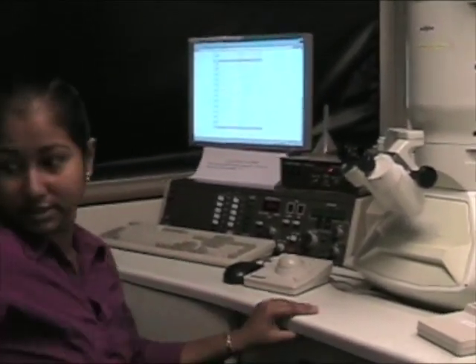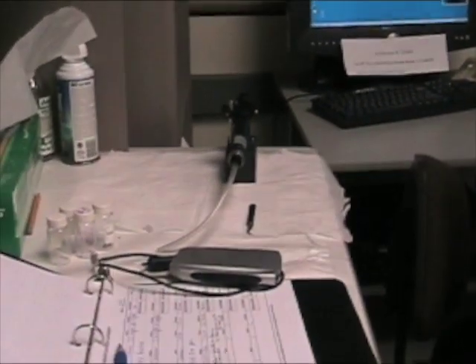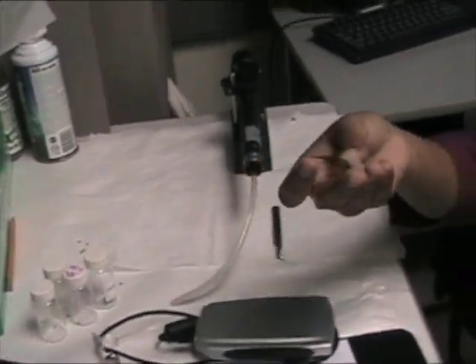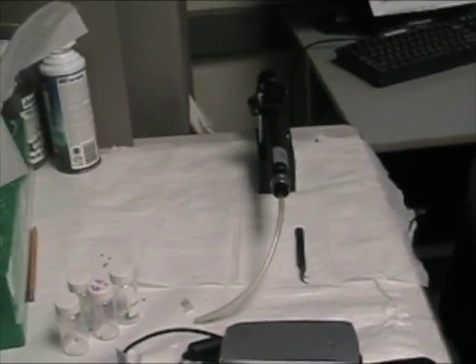When we are inserting the sample, this is the sample holder in here. It can hold up to five samples. But because there are these small rings to plug in our samples and screw them in, we have four rings working right now. So practically it can go up to four samples.